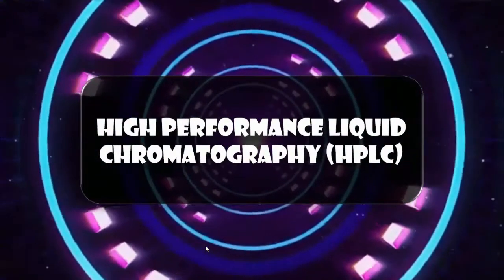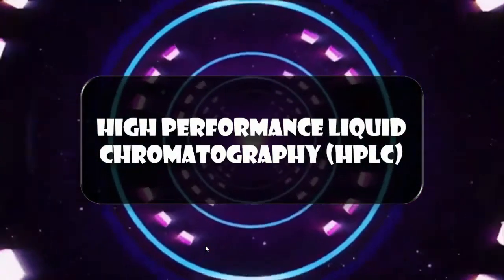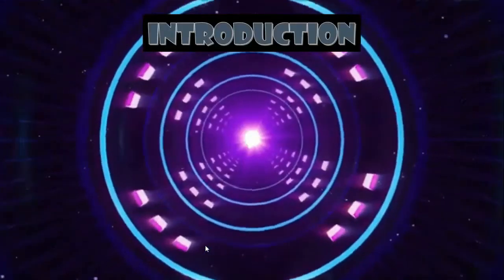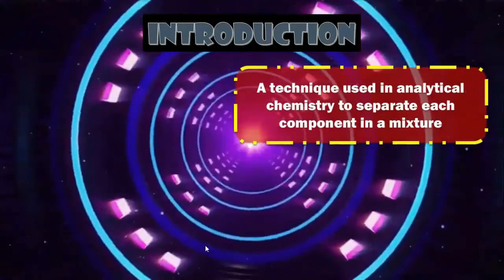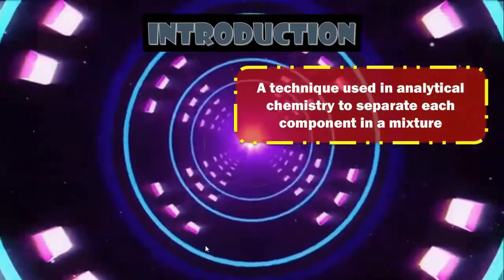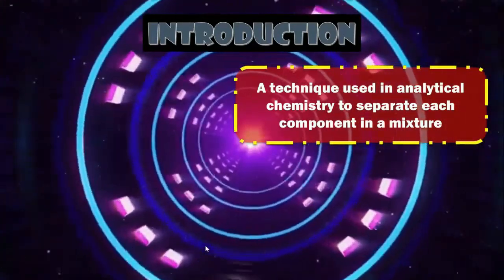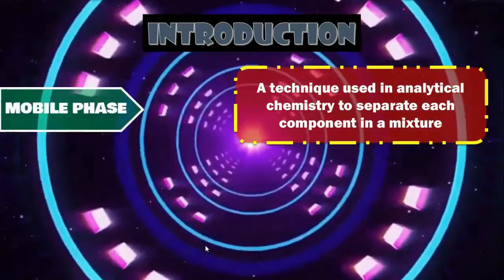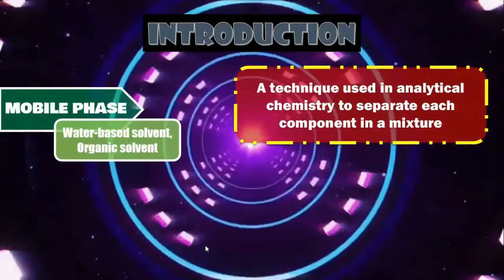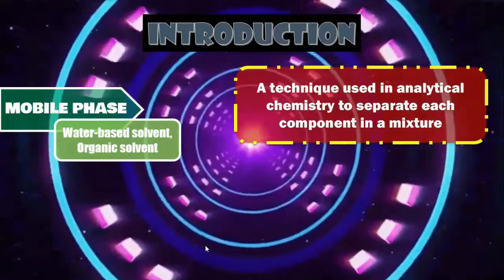Hi guys, I'm Aminuddin and I'm going to start talking about the introduction to high performance liquid chromatography, also known as HPLC. HPLC is a technique in analytical chemistry used to separate, identify and quantify each component in a mixture. As with other forms of chromatography, in HPLC there is a mobile phase, which can be a water-based solvent, an organic solvent or a mixture of the two, forced by a pump to pass through the system.